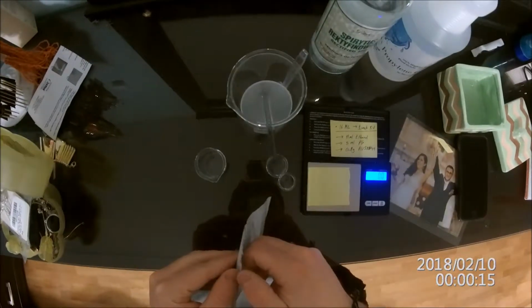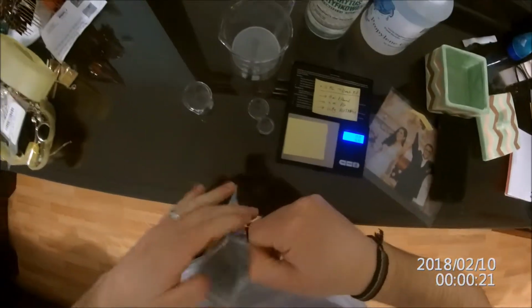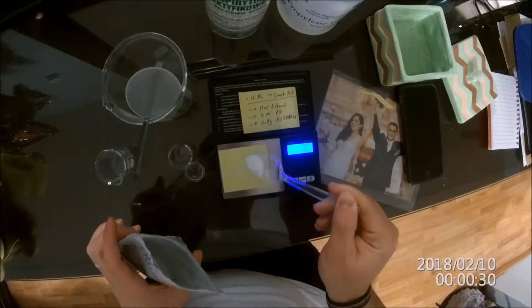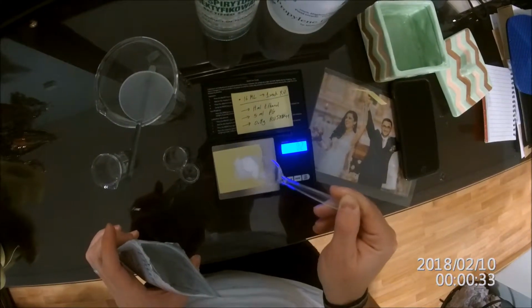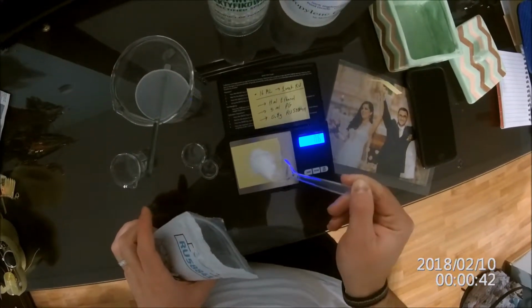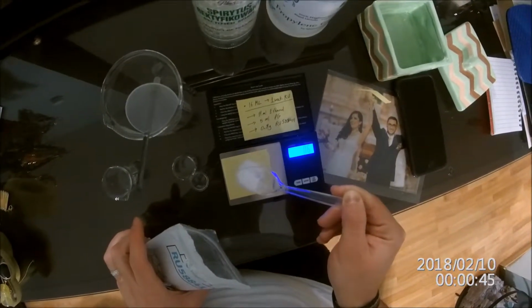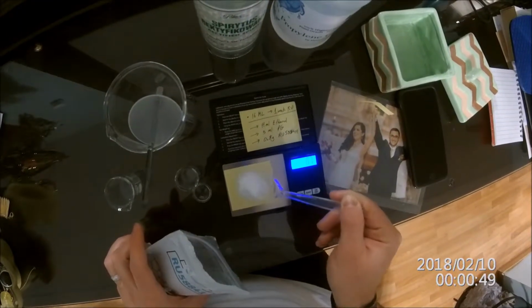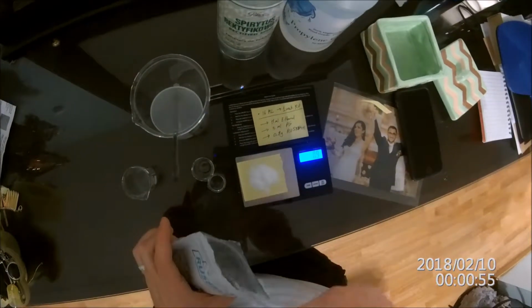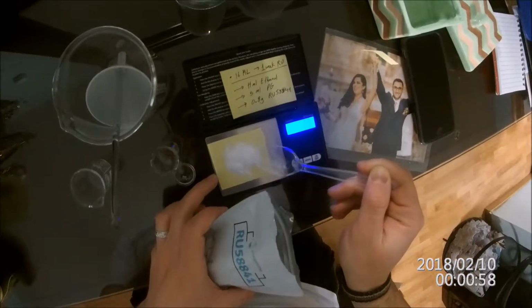Okay? So now I can go ahead and measure the exact amount of RU powder that I need, which is going to be 0.8 grams. So you got to be very careful. You don't spill, so hopefully I don't spill any of this, because this is expensive stuff. So you grab it with a plastic spoon. So I got 0.2, 0.6. That didn't add anything. 0.7. Oh, 0.9. So I put in too much. I need to take some off.